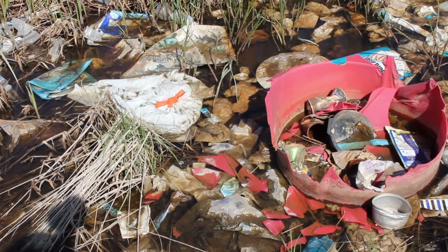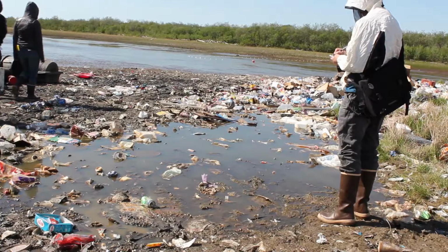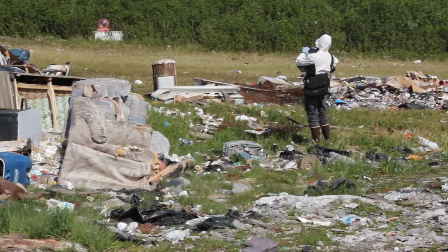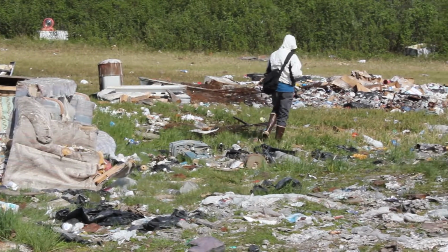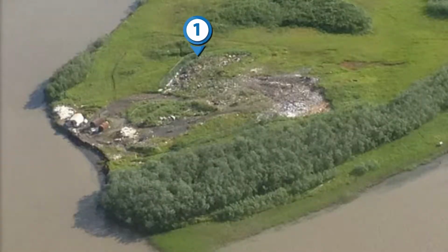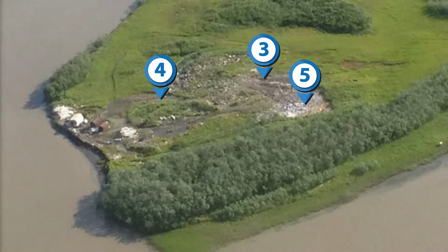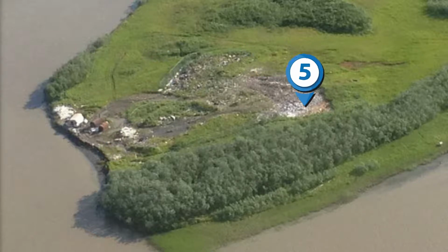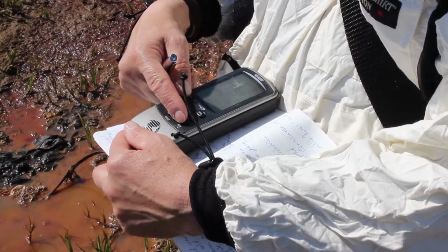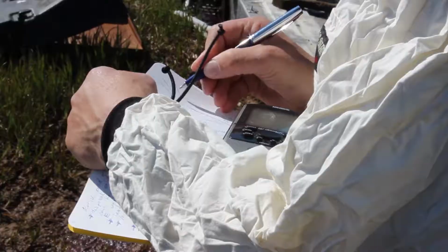Look for standing water that is close to the waste and is deep enough to get a good sample without disturbing the water too much. You will need to take water samples at multiple locations within the landfill. Creating a 5-point star pattern for sampling sites is a good sampling design method. Take GPS readings of the sampling locations and write them down so you can return to the same location easily.